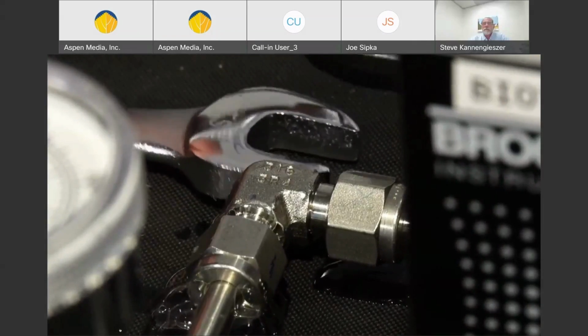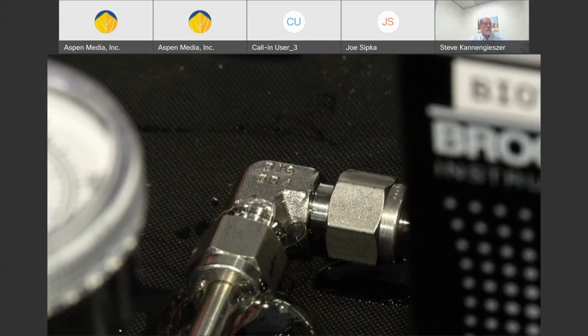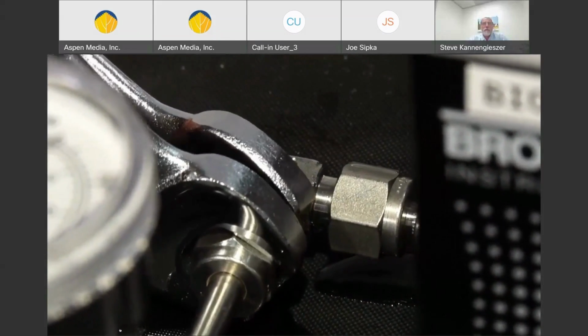If during a routine maintenance, a fitting was not connected properly, this is how a leak could look when caught during a system leak check. As you can see, the leak detection fluid is indicating a leak at the process fitting through the formation of bubbles. I'm now going to properly tighten the process fitting, and you will see the bubbles stop.